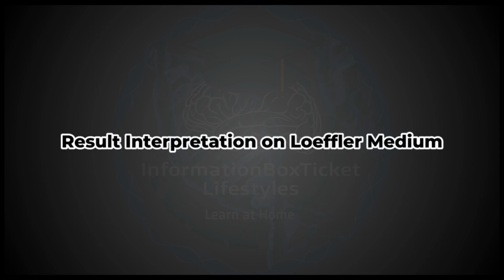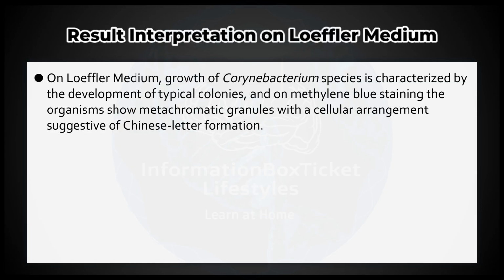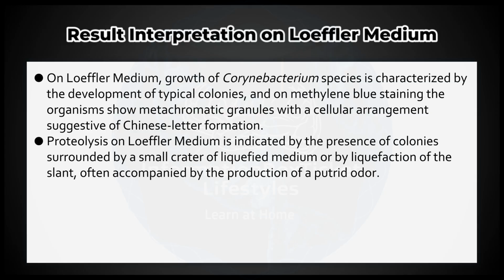Result interpretation on Loeffler Medium. On Loeffler Medium, growth of Corynebacterium species is characterized by the development of typical colonies, and on methylene blue staining, the organisms show metachromatic granules with a cellular arrangement suggestive of Chinese letter formation. Proteolysis on Loeffler Medium is indicated by the presence of colonies surrounded by a small crater of liquefied medium or by liquefaction of the slant, often accompanied by the production of a putrid odor.